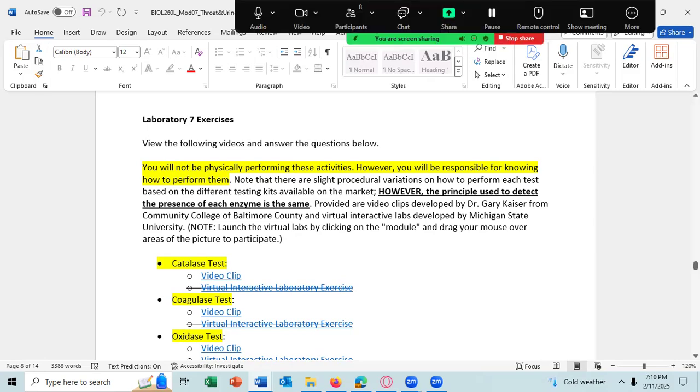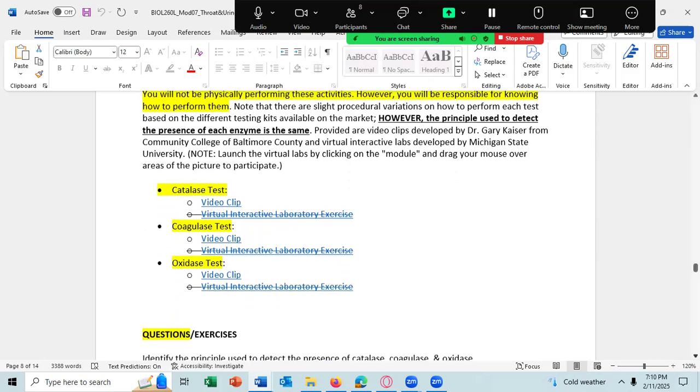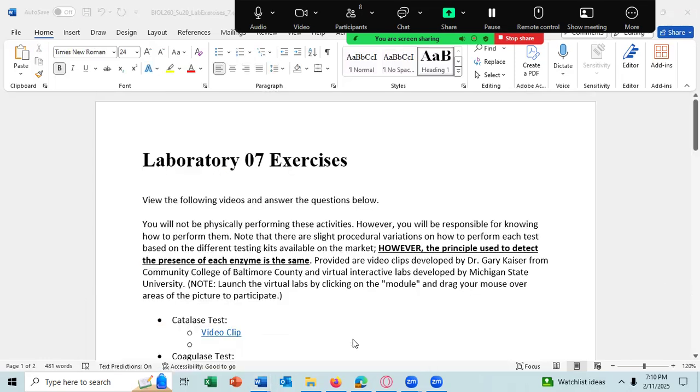We have some videos for you to watch on the catalase test, a real short video, and then a video on the coagulase test, and then a video on the oxidase test. Any questions about any of that? There is no virtual lab, because the only virtual lab we have runs on Flash and it doesn't work anymore. All right, let me go to the worksheet.